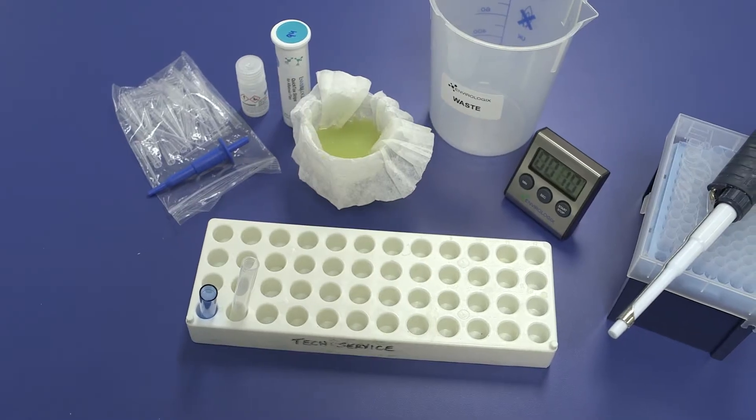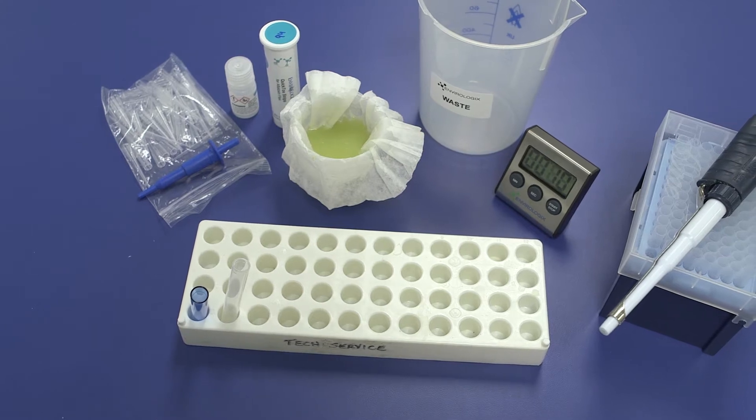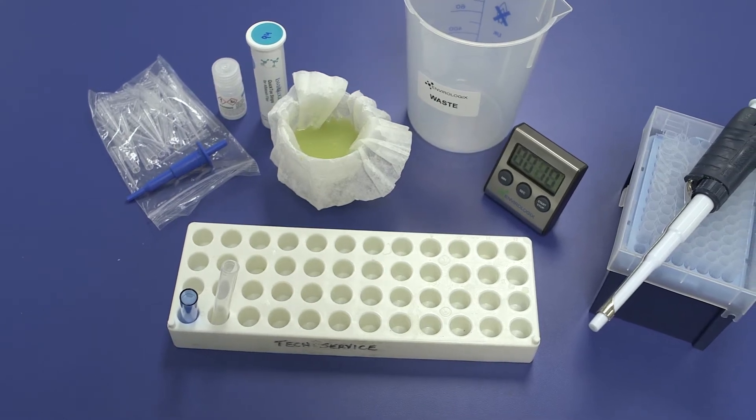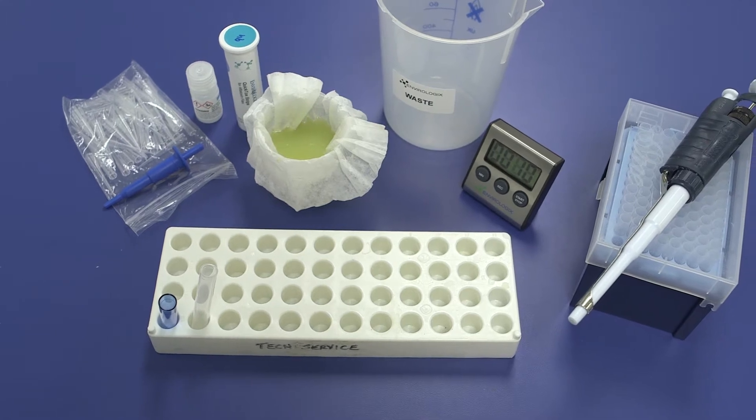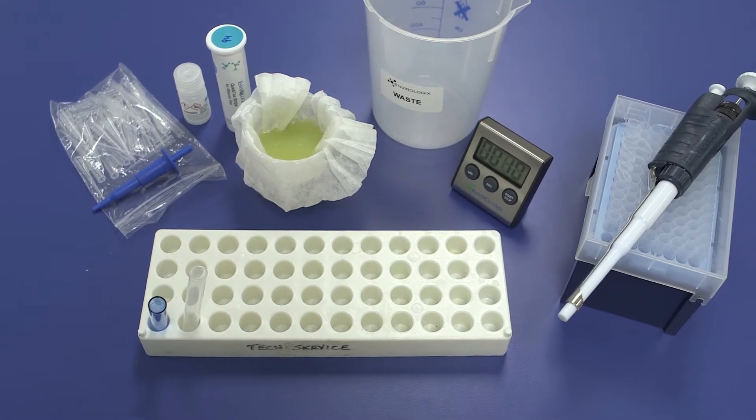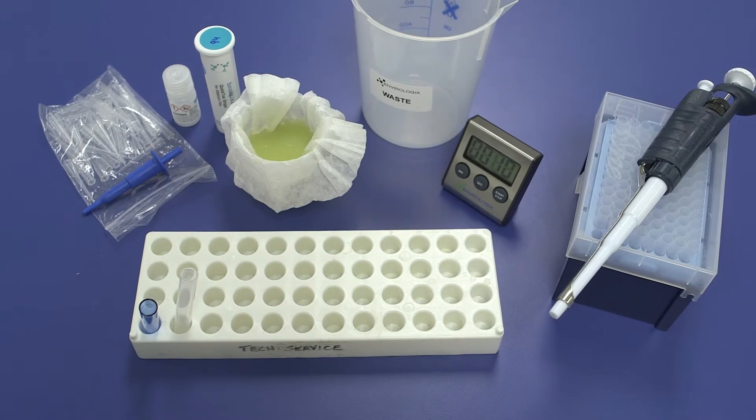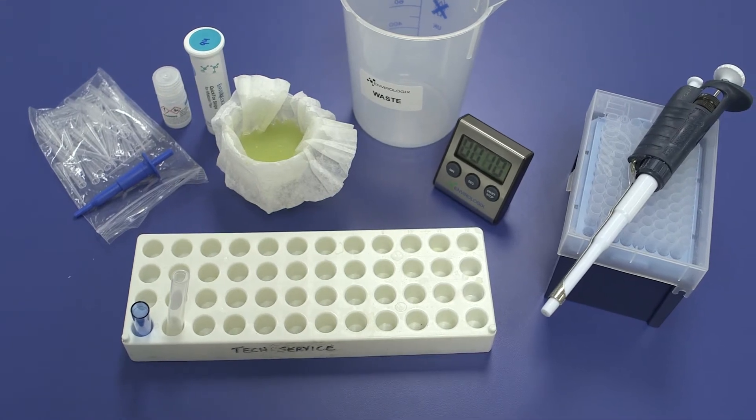Extra tubes and EB-17 pouches are needed when running dilutions. For optimal accuracy, we recommend using a 1-milliliter adjustable pipette for dilution preparation. See the available accessories section of the product insert for ordering information.